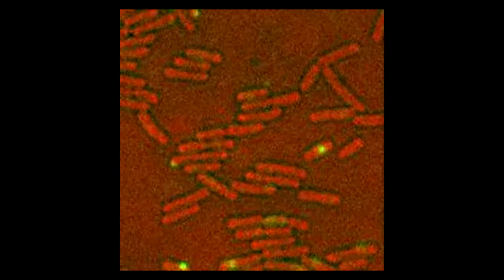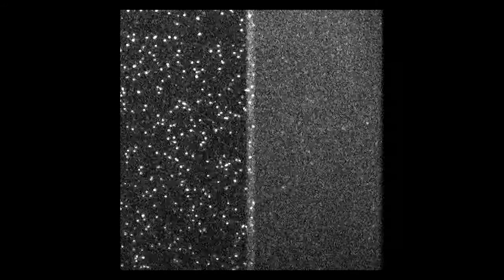It's pretty cool to be able to look on the screen and realize that you're looking at individual molecules that are undergoing a very complicated biochemical reaction that is essential for life.